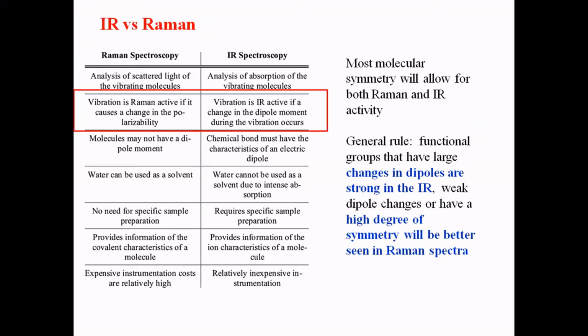Maybe Raman is highly expensive when compared to IR, but the collection of information is completely different from IR. Though the frequency numbers are the same because it originates from vibrational spectroscopy, you still get a lot of information from Raman.